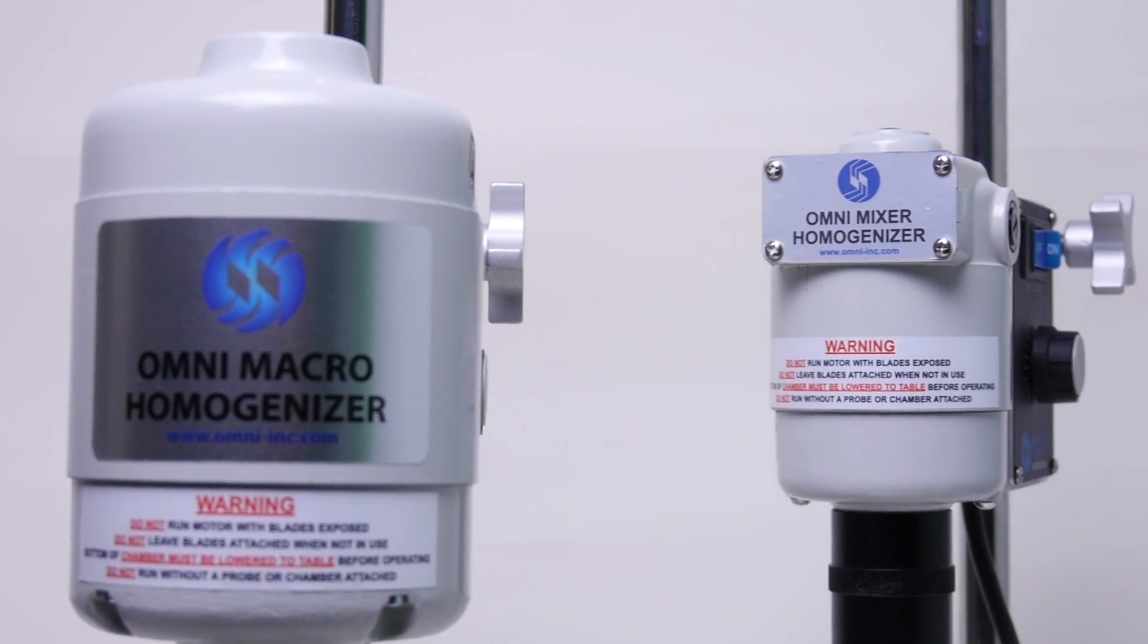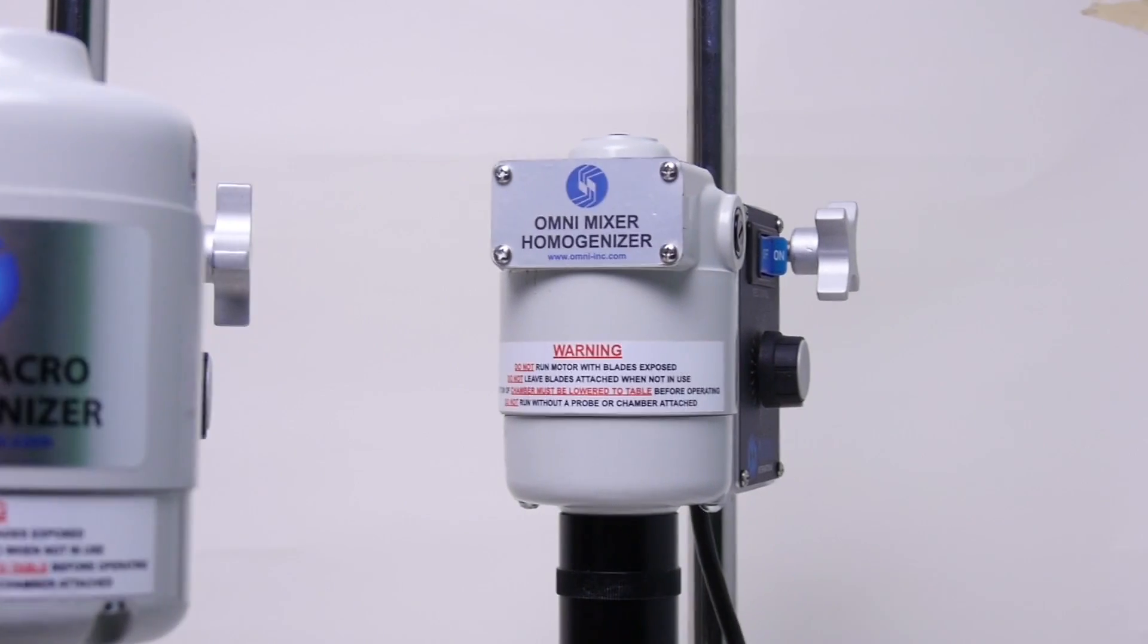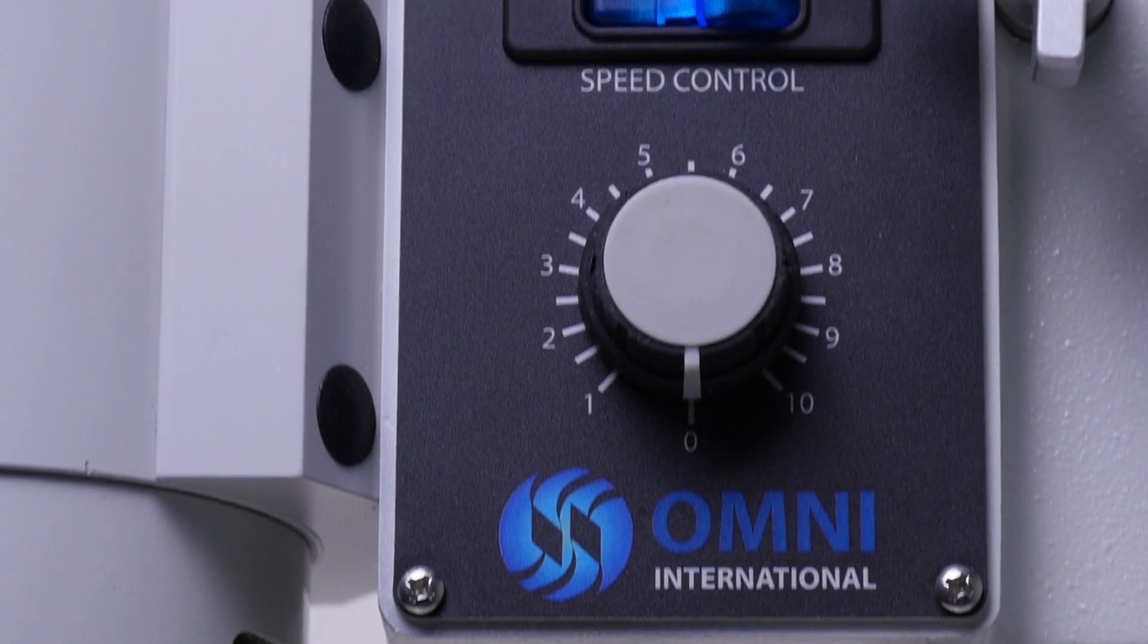Omni Mixer and Omni Macro homogenizers offer the perfect mix of dependability, versatility, and power.